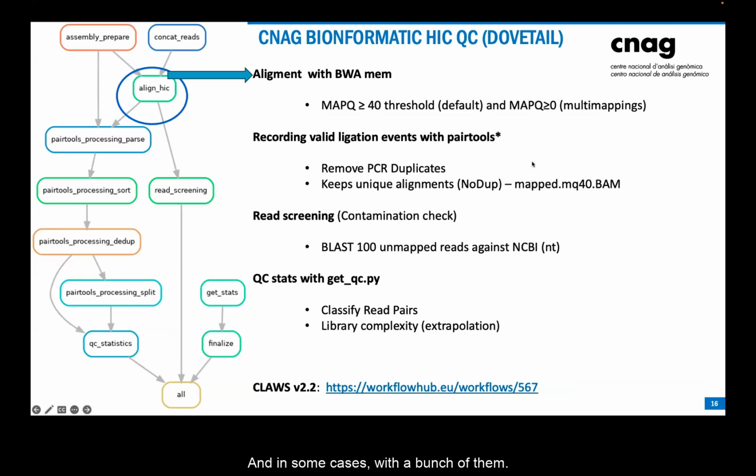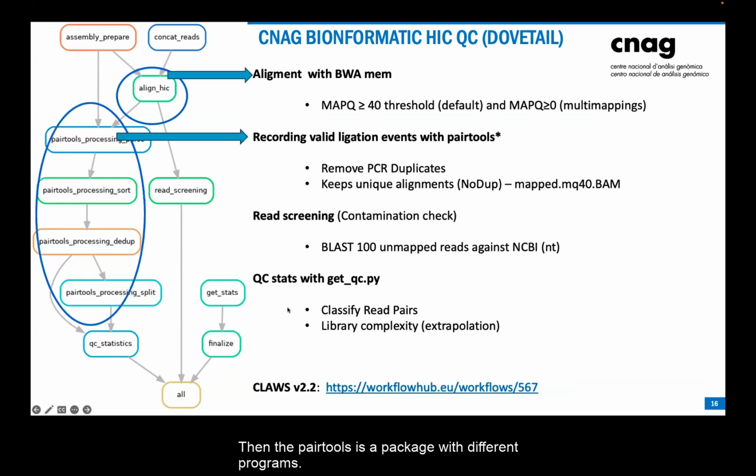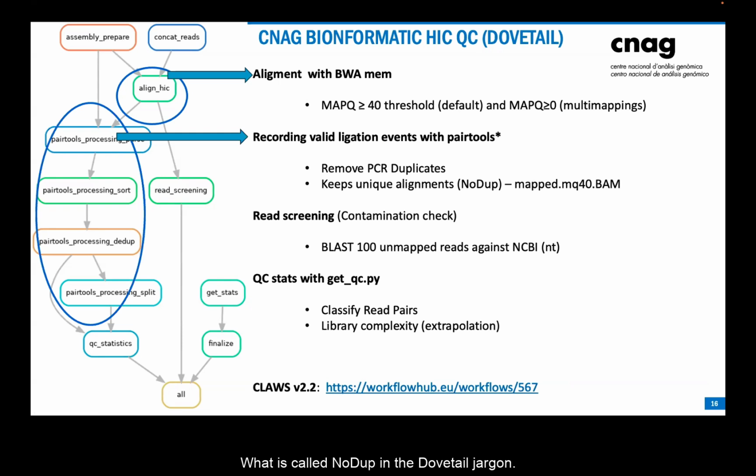Then pairtools is a package with different programs, but basically what it's going to do is record the valid ligation events. And we remove the PCR duplicates and keep those paired mappings that are unique, what is called no dupe in the Dovetail jargon.